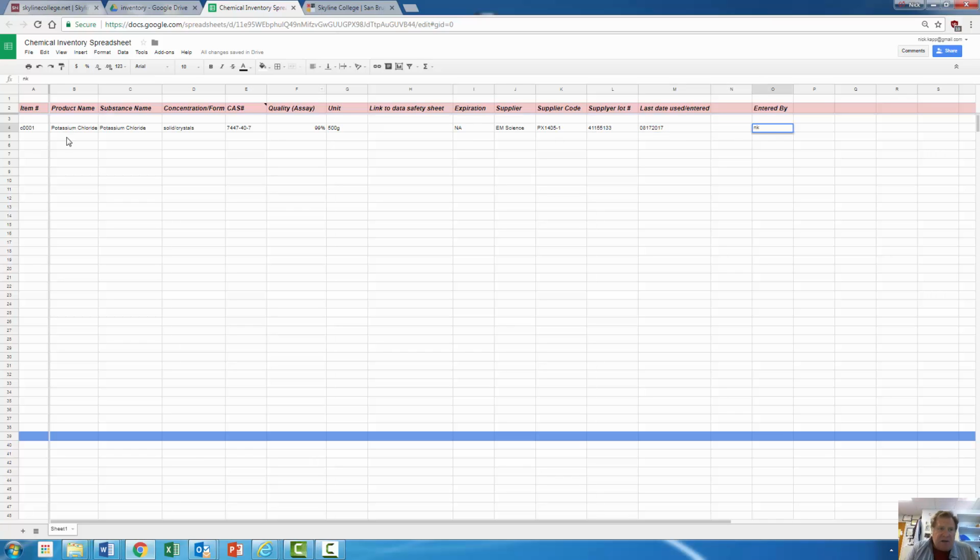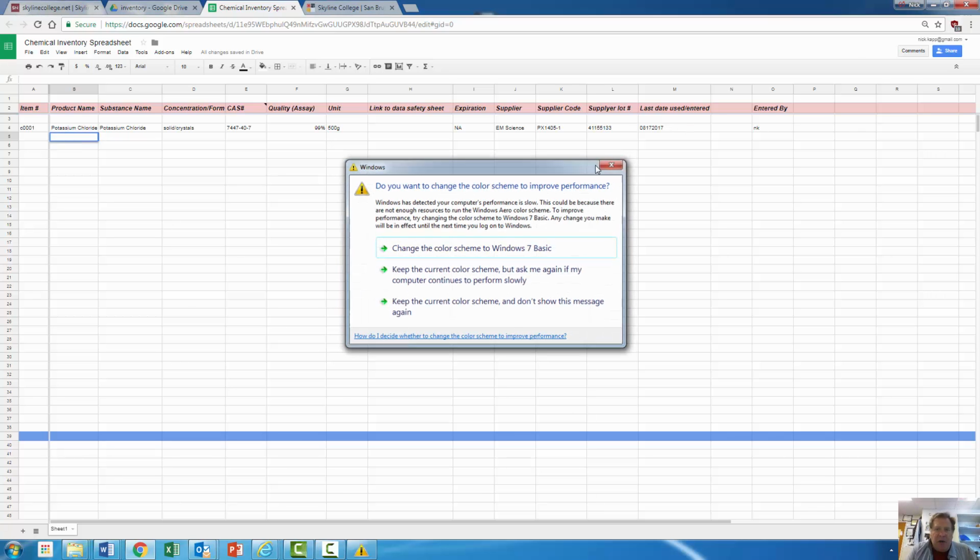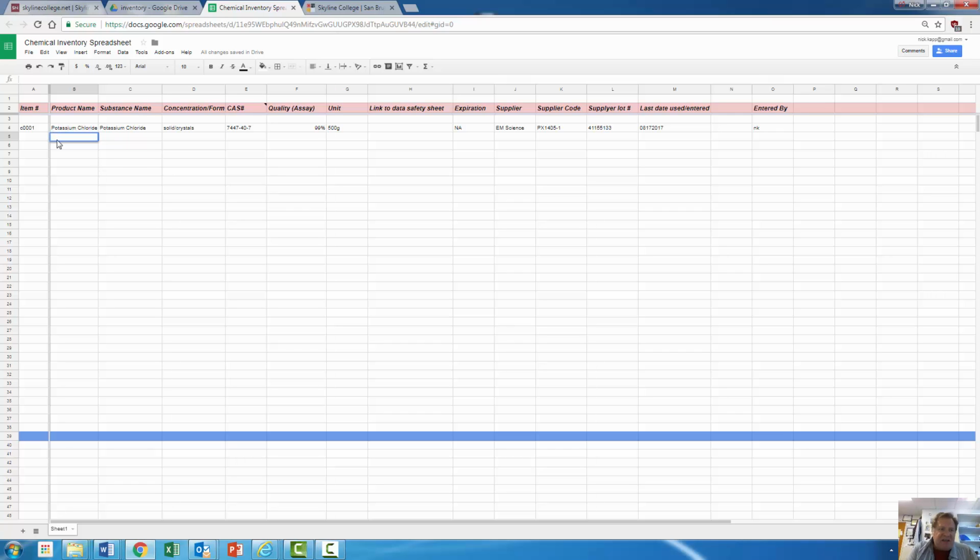All right. So now, what's really great about these lists is, if you're going to fill this out and I'm going to repeat potassium chloride, boom, it will pop up potassium chloride in there already. And so what I got to do is look at, well, was this piece inventoried before? And so what I want you to do is I gave you a bunch of little dots, and you're going to put a dot on the top. And so if you've inventoried something, make sure that you have the dot on top, or you can write on it with a Sharpie saying inventory by, etc. And you can do all that kind of stuff.